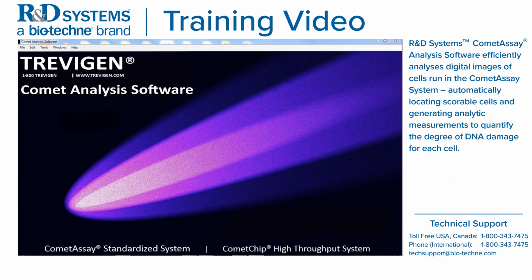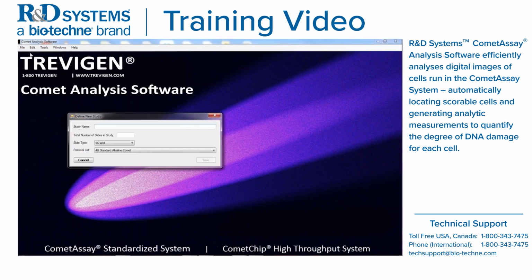So once the COMET Analysis software has been installed on your computer, a COMET application icon is automatically created on the desktop. So let's click on the icon to begin. The first step in using the new software, you need to begin by creating a new study. So for this demonstration, we'll go under File and we'll hit New Study.